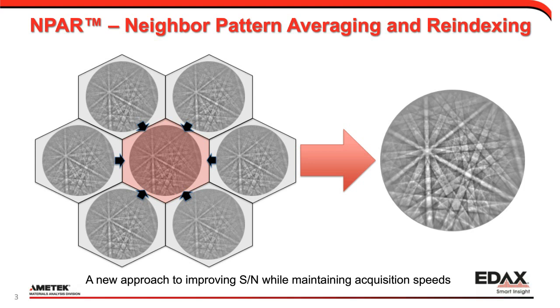And I've had multiple times already in the last year with NPAR where I've had samples that I wouldn't even think about doing, and was able to get good, consistent data on these samples, that in the past would just sit there and we'd say, hey, sorry, we can't do these. That's not what we want as a company. We want everything to be doable, and NPAR expands that group.